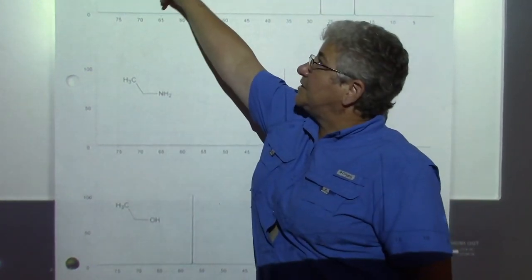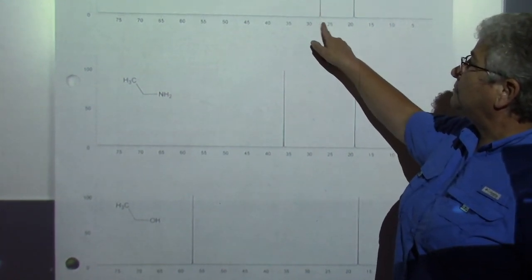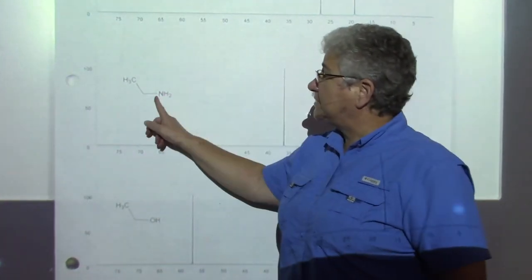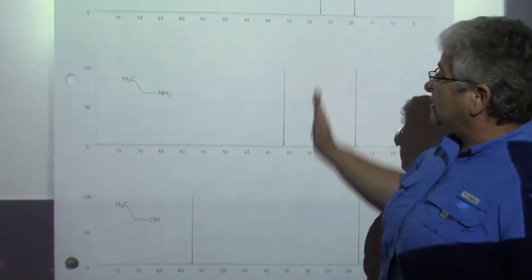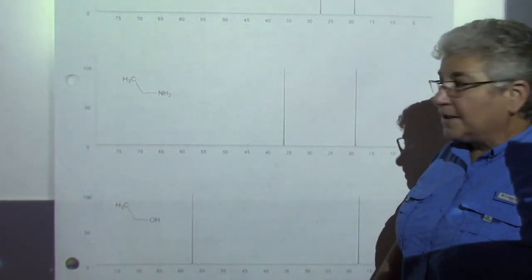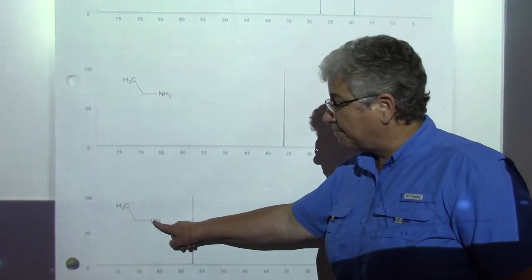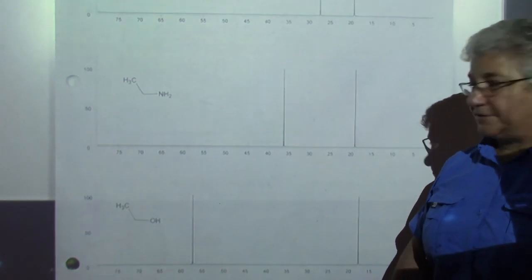In this case, the CH2 carbon is bound to a bromine. And so that pulls it a little bit further downfield, right? So now I'm at about 28 or so. But when this bromine is now changed to a nitrogen, when I have a carbon bound to a nitrogen, you can see that that pulled it even further downfield. So now I'm about 37. And if I change the nitrogen to an oxygen, my carbon that's now bound to an oxygen moves all the way down here to about 57, right?